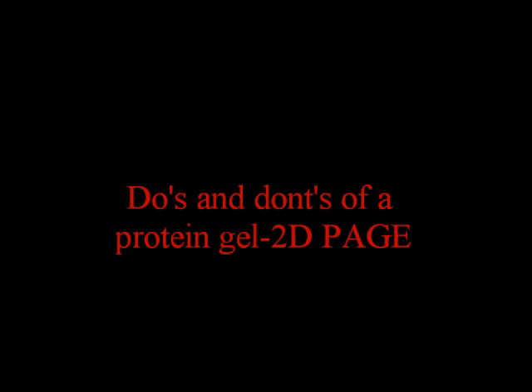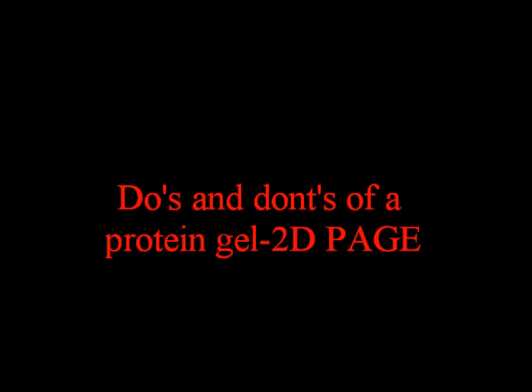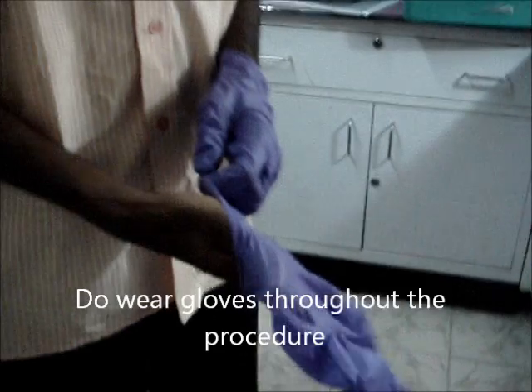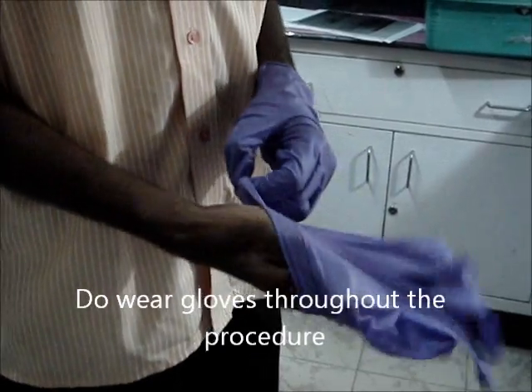Do's and Don'ts of a Protein Gel: 2D Gel Electrophoresis. Step 1: Sample Preparation. Always wear gloves before starting the experiment.